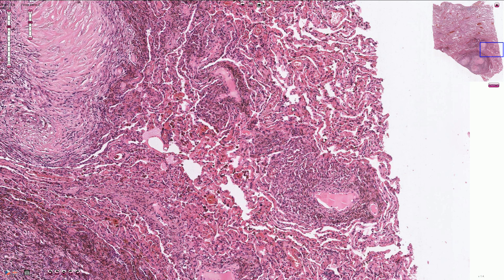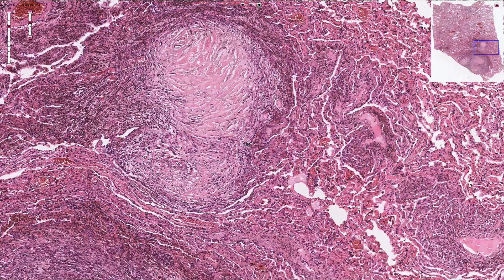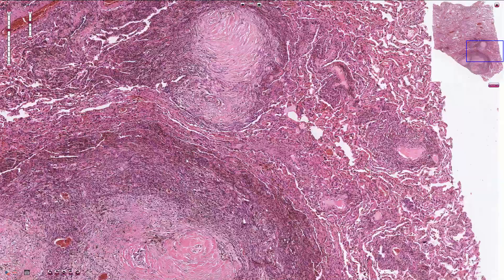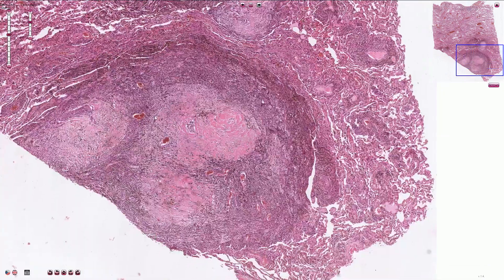Over time, it can progress to the stage of silicotic nodules which measure up to four millimeters, but they slowly progress to large silicotic nodules and the stage of progressive massive fibrosis. In this example, we can see confluent large silicotic nodules and fiber production together with anthracosis.